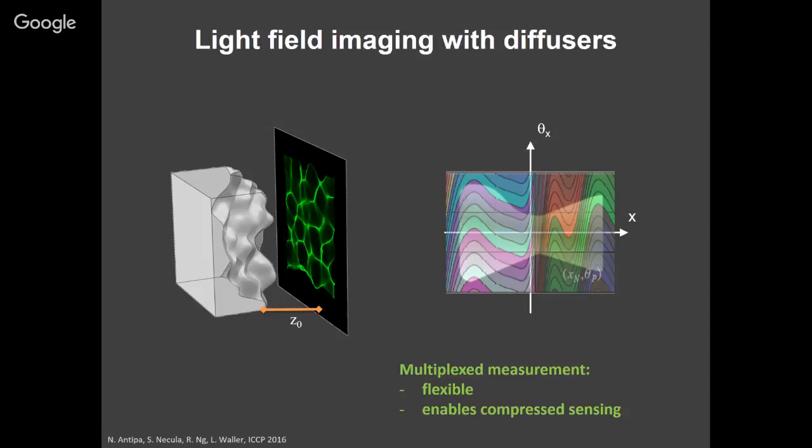You want to keep the apertures of your lenslets matched to the aperture of your main lens in the microscope. So that's NA matching, or aperture matching. And so it's not flexible for changing different apertures, which you like to do very often in a microscope. This multiplexed version doesn't care. It doesn't have a particular focal plane that it cares more about than the others.